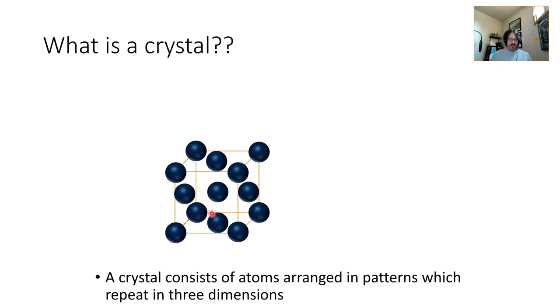And if we look at this unit cell, I think this is face-centered cubic, and I did my best to draw it as face-centered cubic. I painstakingly drew it in PowerPoint, had to Google how to make a sphere in PowerPoint, so this isn't a circle, it's actually a sphere, even though I probably could have achieved the same result just by drawing circles.